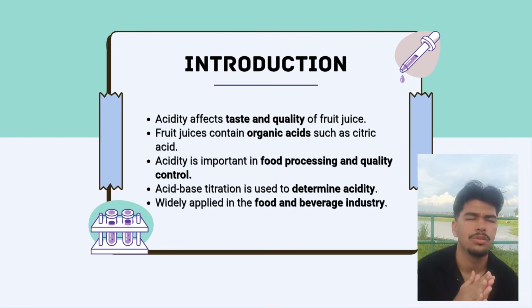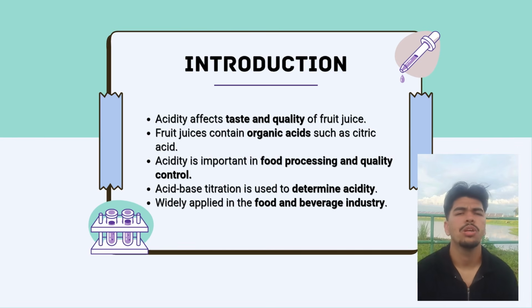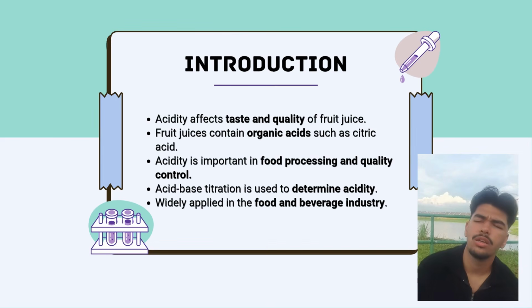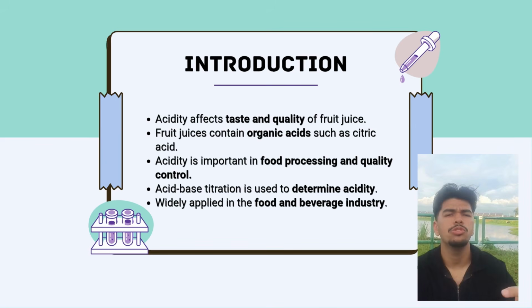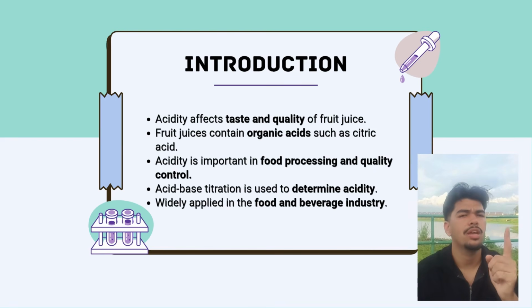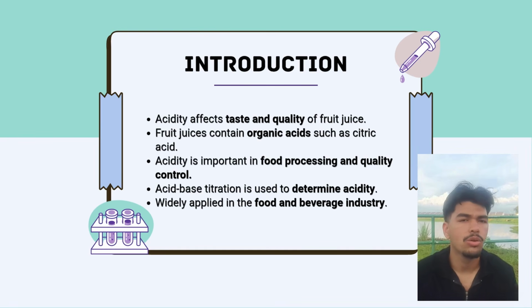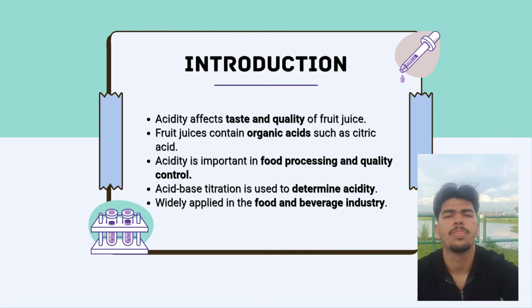Presenting on the determination of acidity in fruit juice. Acidity is one of the most important characteristics of fruit juice because it influences the taste, quality, freshness and shelf life of the product. Fruit juice naturally contains organic acids such as citric acid, malic acid and tartaric acid.